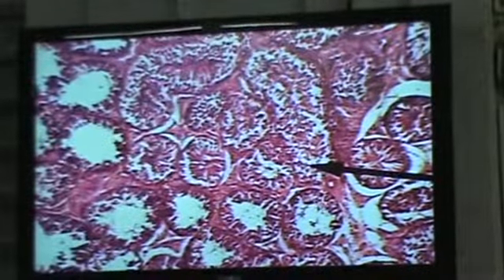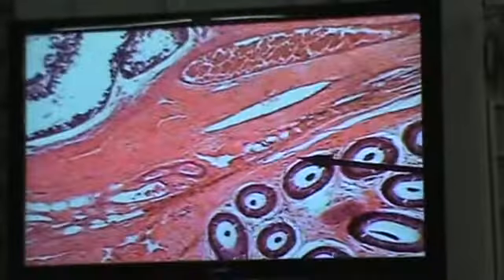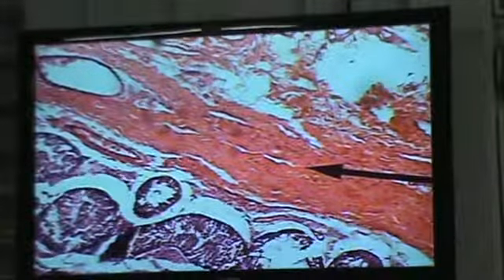Okay, so here we see another testis. Okay. So I'm really now focusing here. Good. So I'm going here just for a reason. What do you think will be seen right here? What am I looking at right here? What's all of this right here? All along right here. What's all of this? So let's go and look here. So what are we looking at first of all? Okay, good. What's that? Okay? What are we looking at here?